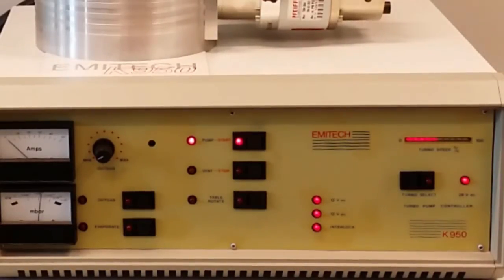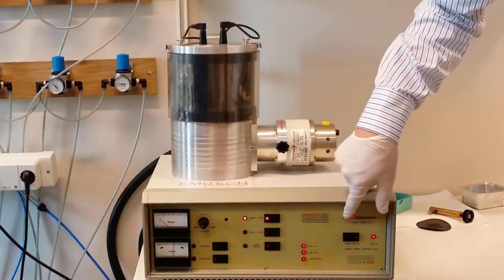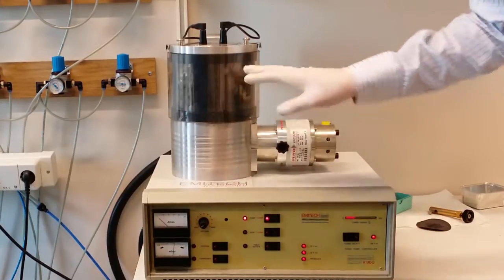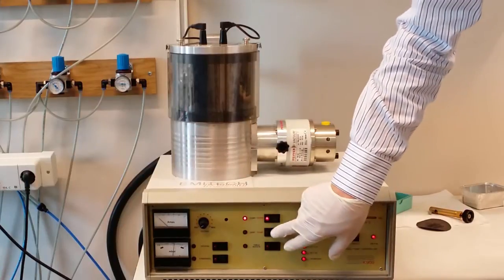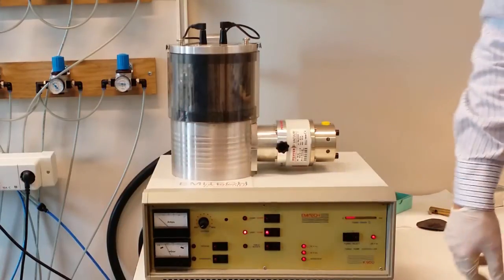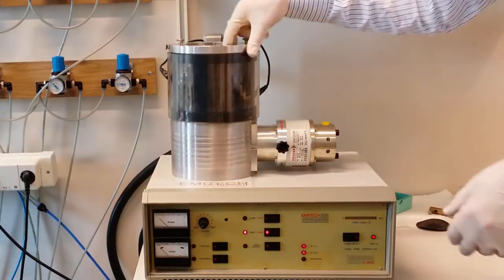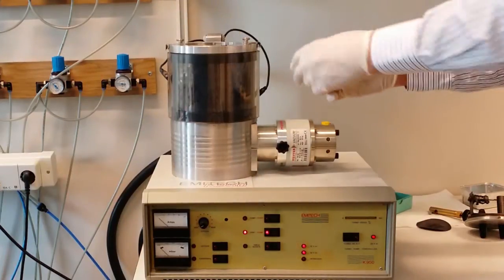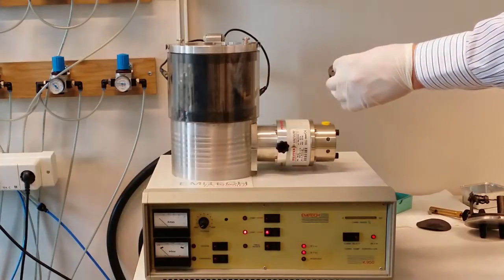You should at least wait until you have three diodes here on the scale, or less. So now we have reached three diodes on the scale here. So now the pump has sort of stopped and we can vent the chamber and let air inside. Okay, our sample is finished. Now let's instead try the gold sputtering machine and see how that one works.